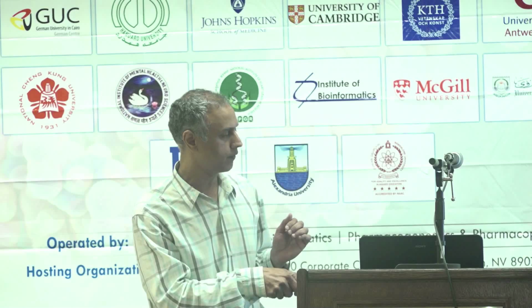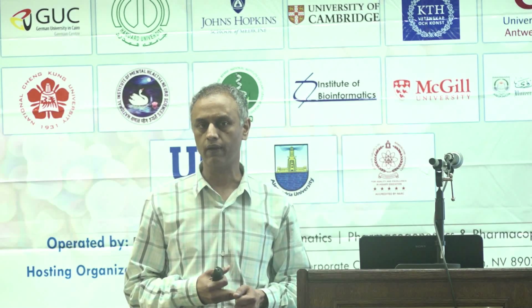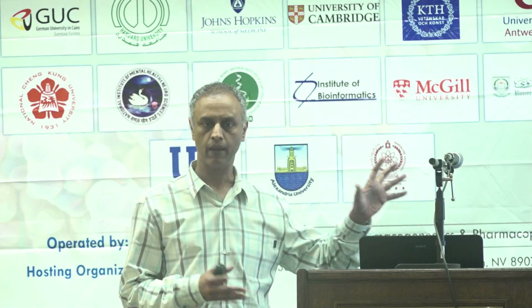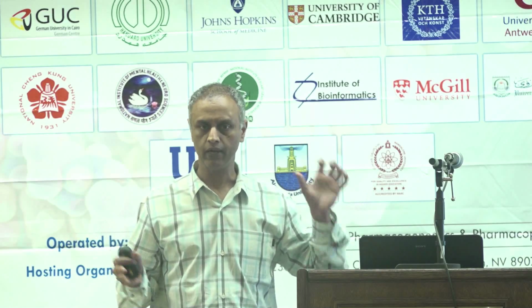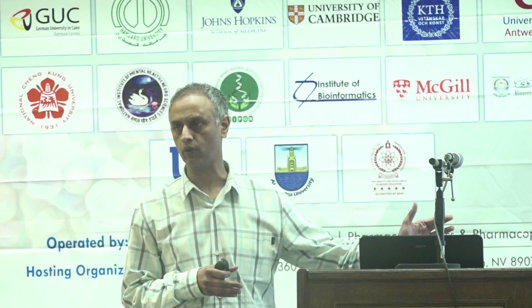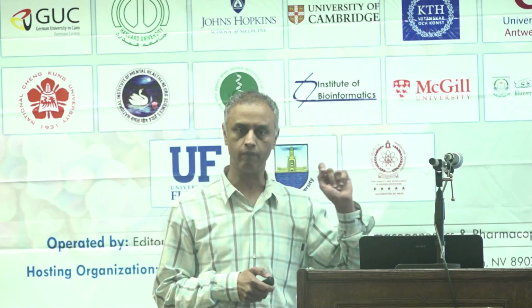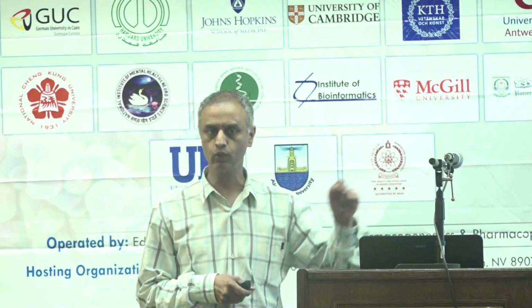But here we have, 2 years ago, MALDI-TOF approved, first by the European FDA and then by the US FDA for microbial identification. And almost 14 years ago, we made the decision not to use this technology because of several problems. And yet, in the world of microbial diagnostics, it is useful enough.